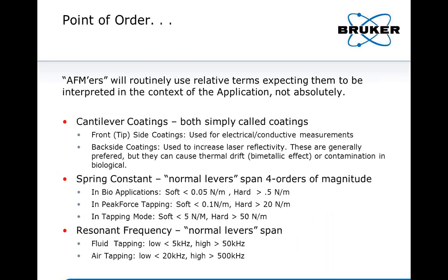So lastly, as a point of order, AFMers will routinely use terms expecting them to be interpreted in the context of an application and not absolutely. Some common examples of this are when AFMers talk about probe coatings, spring constants, and resonant frequencies.